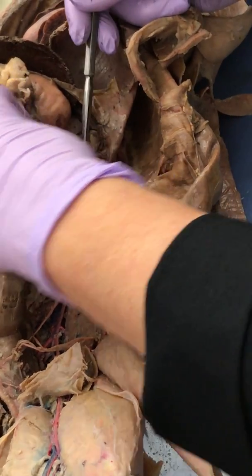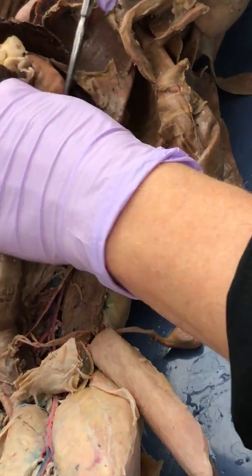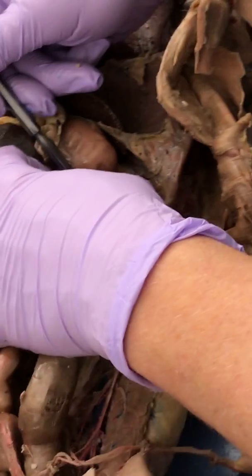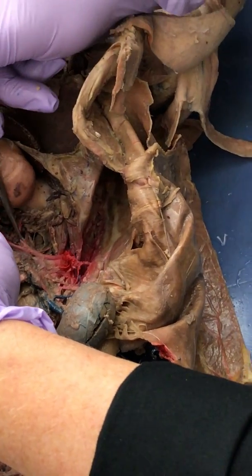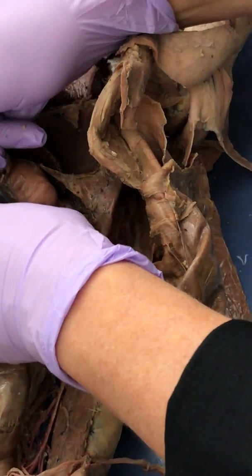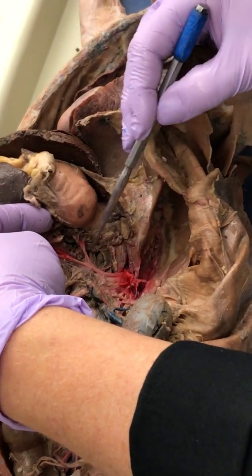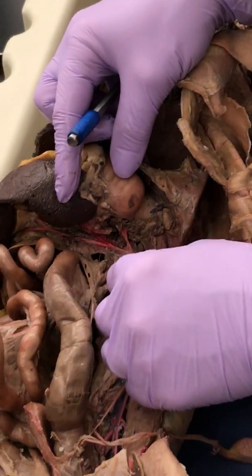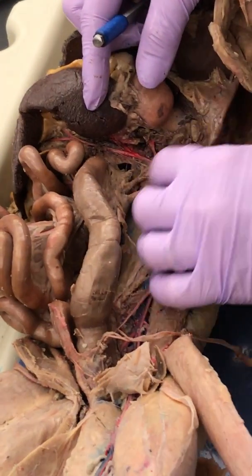Okay. This artery? Celiac. Okay, did you guys find the hepatic? Yeah, you did. Look. Hepatic artery. Oh, I had to reach in there and grab it. It's because it's underneath there. It's hiding. And then there's a lot of stuff there. Yeah. So, hepatic. How about this one? Gastric. How about that one? Splenic. That's good. What's this little bean? Adrenal gland. Okay.